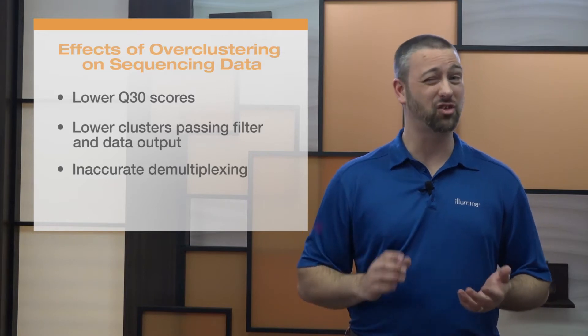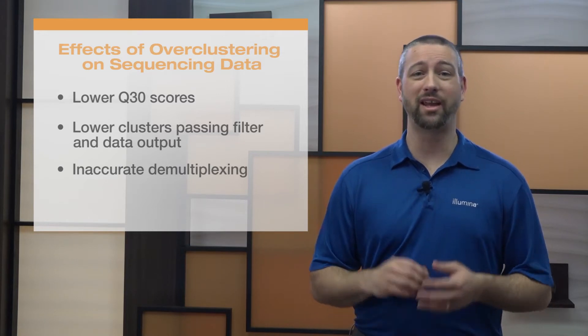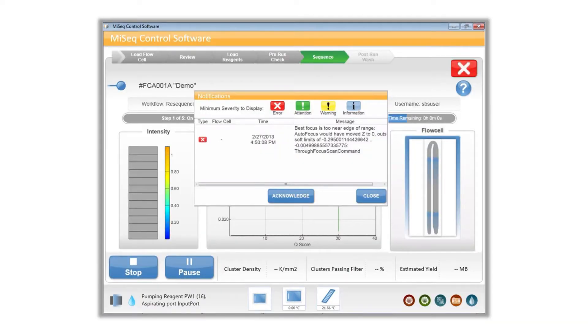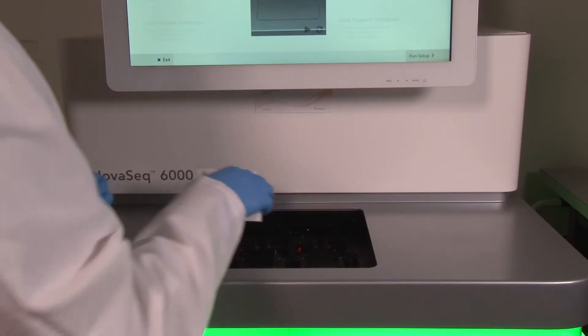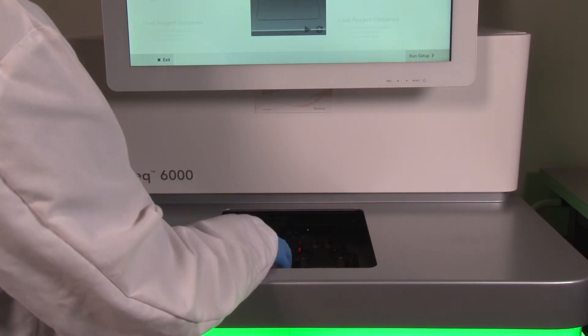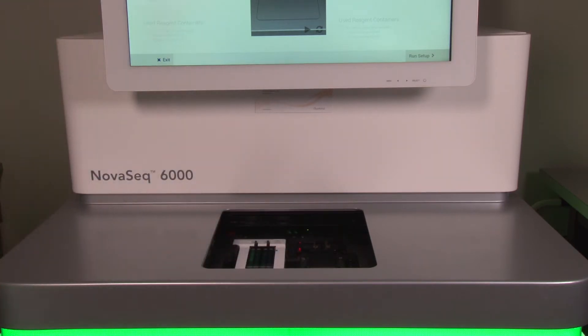Finally, when over clustering is extreme, image focusing can fail and terminate the run at any cycle, resulting in a run failure. Over clustering can have a significant impact on sequencing data. As for under clustering, these runs still maintain high data quality but lower data output. In general, under clustering is preferable to over clustering because these effects are less severe. If optimal loading concentration is unknown for a library type, it's best to load at a conservative concentration for the first sequencing run.